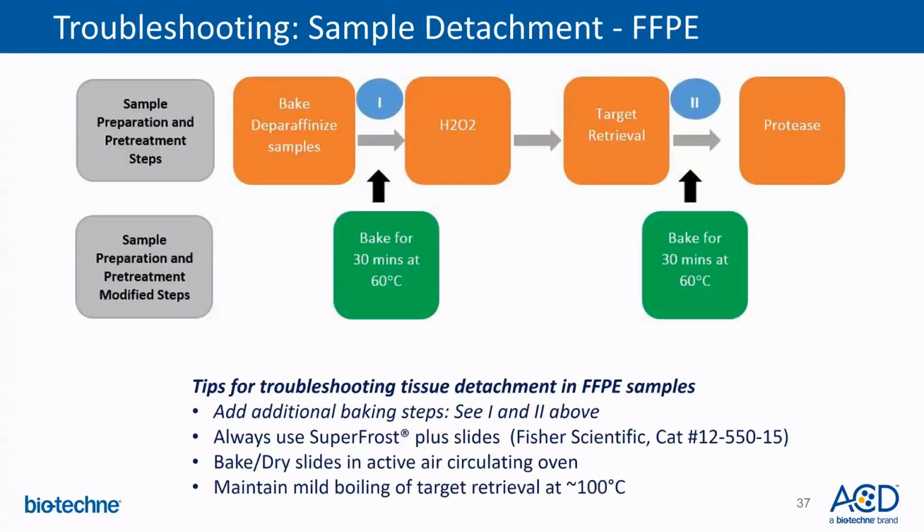We will now look at the troubleshooting tips for sample detachment. We will be reviewing the sample detachment troubleshooting tips based on the sample type. On this slide is shown the sample detachment troubleshooting tips for FFPE samples.